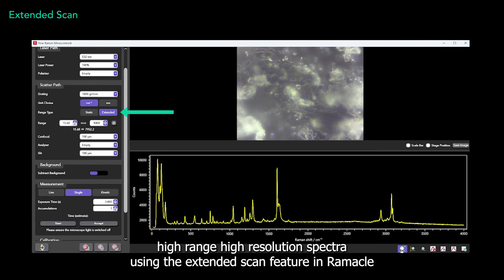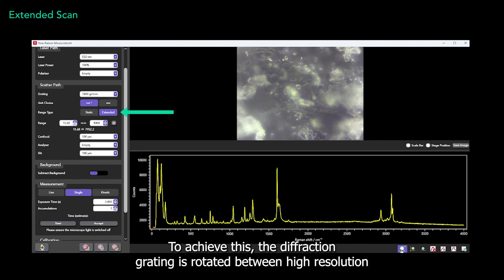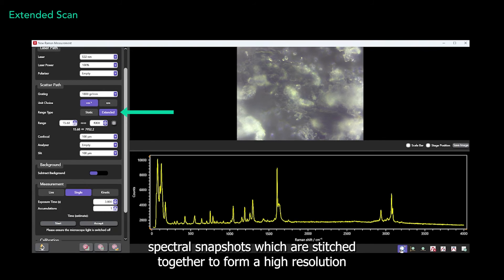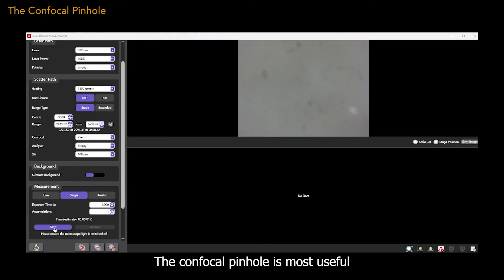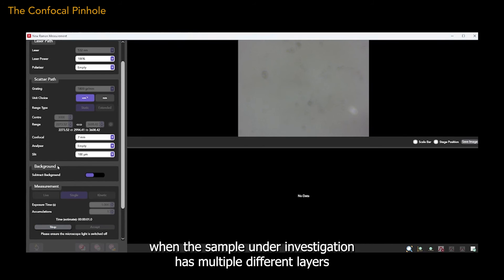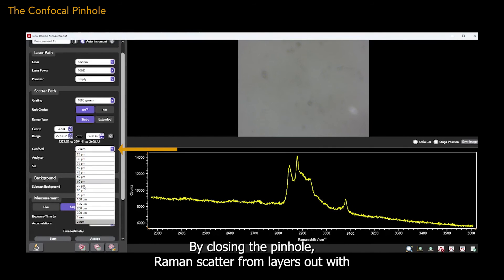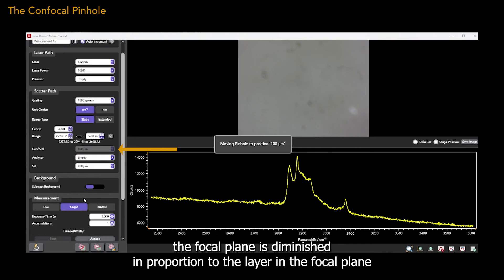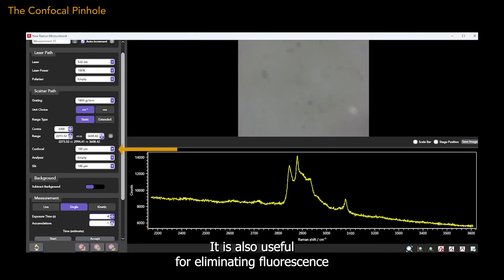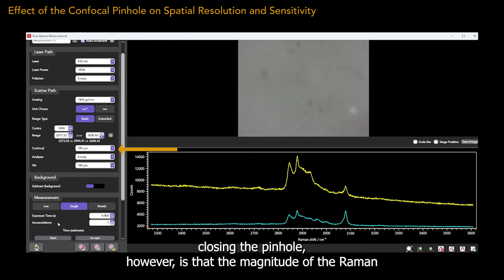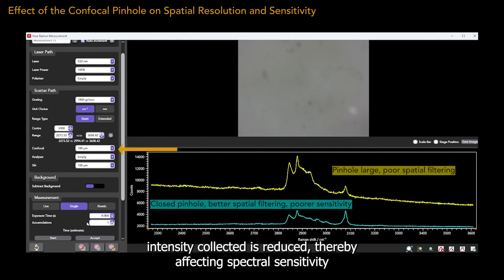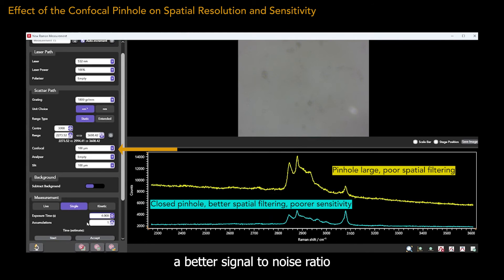It is possible to acquire high-range, high-resolution spectra using the extended scan feature in Ramico. To achieve this, the diffraction grating is rotated between high-resolution spectral snapshots, which are stitched together to form a high-resolution spectrum over a large range. The confocal pinhole is most useful when the sample under investigation has multiple different layers. By closing the pinhole, Raman scatter from layers outwith the focal plane is diminished in proportion to the layer in the focal plane. It's also useful for eliminating fluorescence from the surrounding sample volume. The consequence of closing the pinhole is that the magnitude of the Raman intensity collected is reduced, thereby affecting spectral sensitivity, and higher acquisition times are commonly required to achieve a better signal-to-noise ratio.